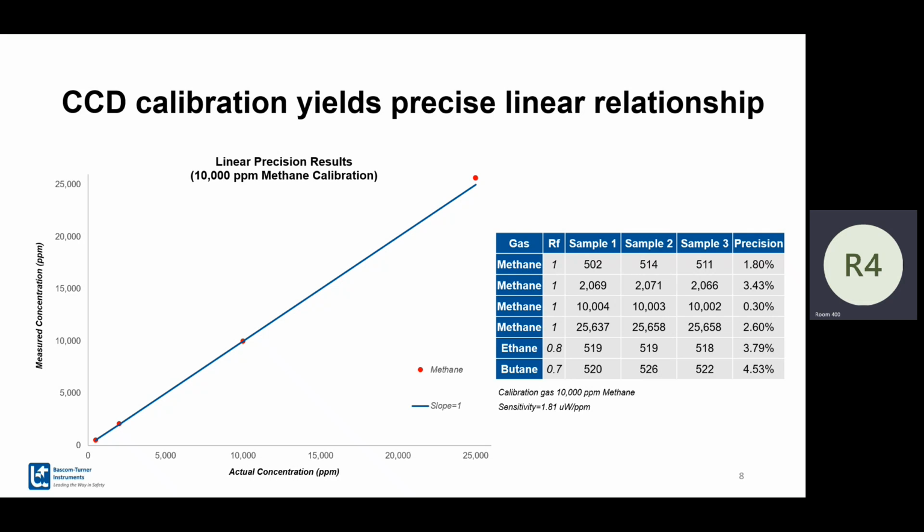With that, when we made this, we were not sure, but reading the procedure, it didn't look like we needed to make three points. We looked at the Method 21 procedure, and it didn't say that you have multiple points. So we thought, okay, let's make it easier because it's a linear device: you have a zero, and then you choose one point because it falls on the slope, and you're done. That was the thought. But the regulations are the ones telling us to use several points to calibrate the analyzer. Yeah, we are better engineers than we are lawyers. So we are learning.